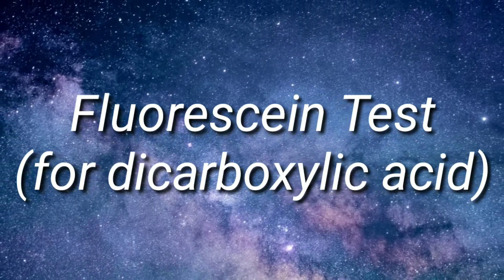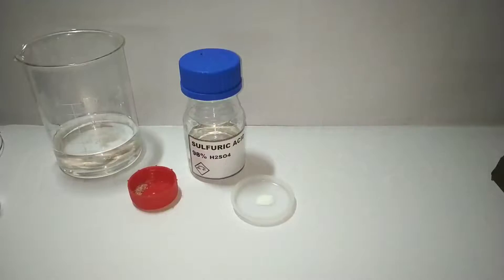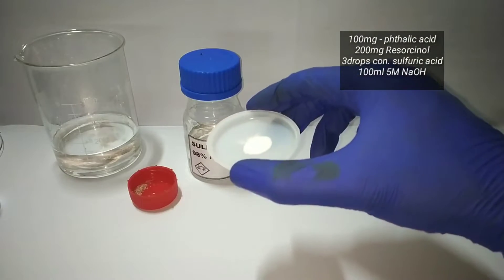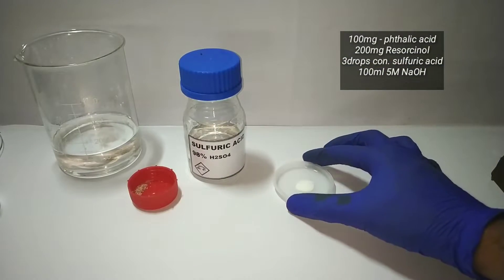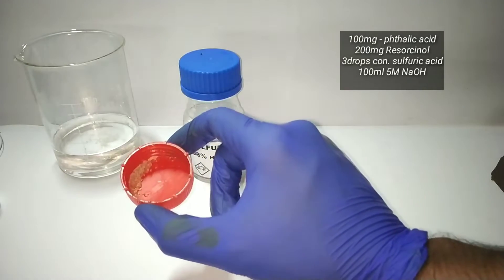Now for the special test, the fluorescein test, which is a confirmatory test for dicarboxylic acids like phthalic acid and succinic acid. For this test I am using phthalic acid.